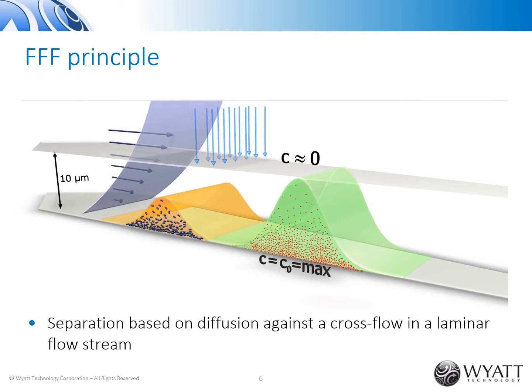Brownian motion acts as a counterforce, working against the concentration. So the molecules are constantly moving up away from the bottom wall, driven by Brownian motion, but they will be pushed back from above by the crossflow. In a stationary equilibrium, this creates a particle cloud with an exponential decrease of the concentration as a function of the distance from the bottom wall. It is exactly the same mechanism which leads to the decrease of air pressure if we rise above sea level.